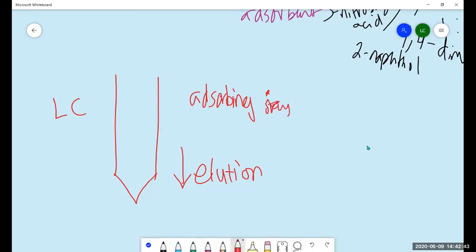And once again, you have your mobile phase, which is still acetone, hexanes.